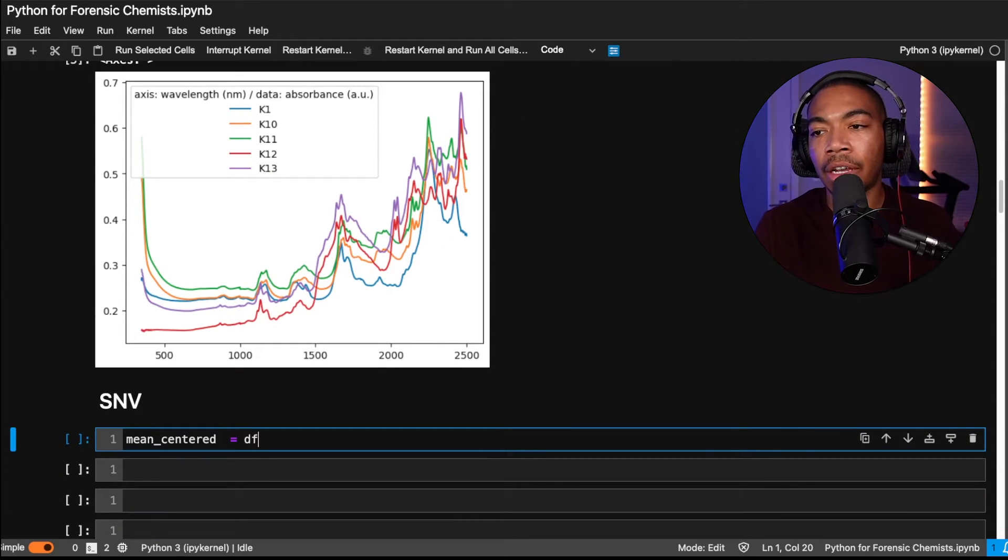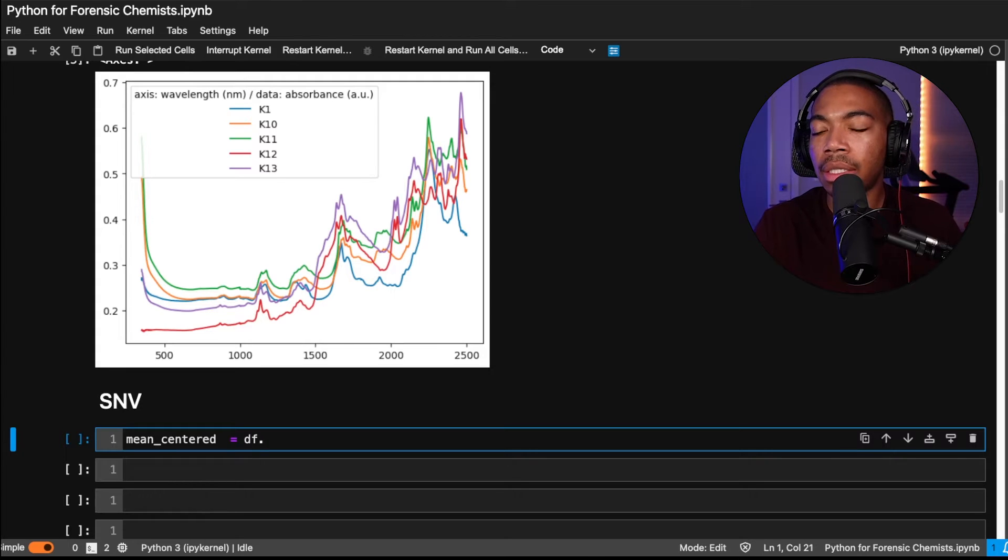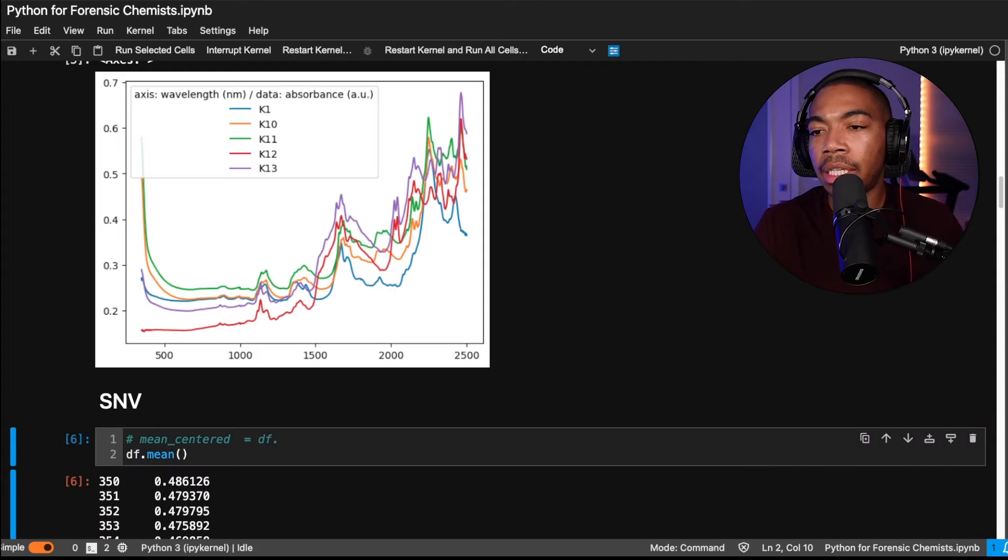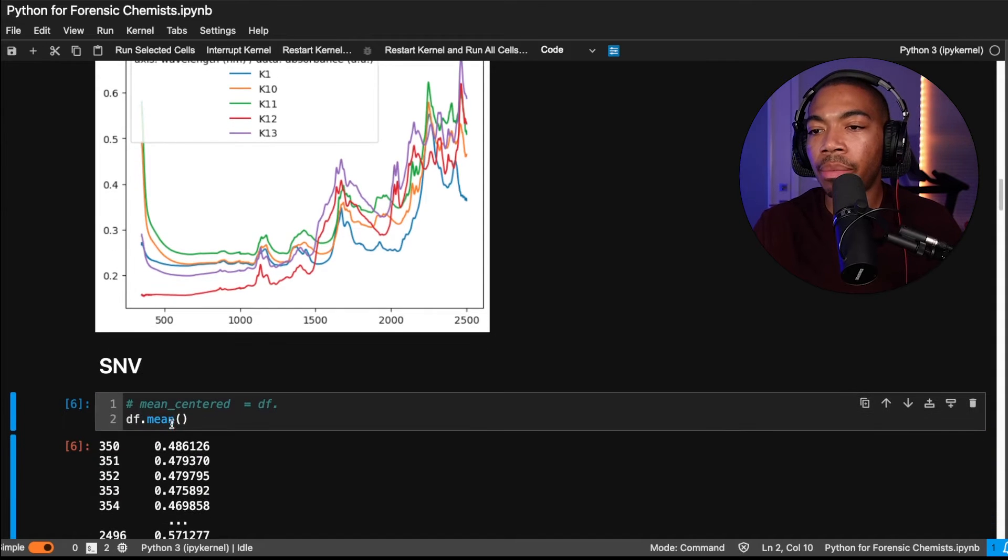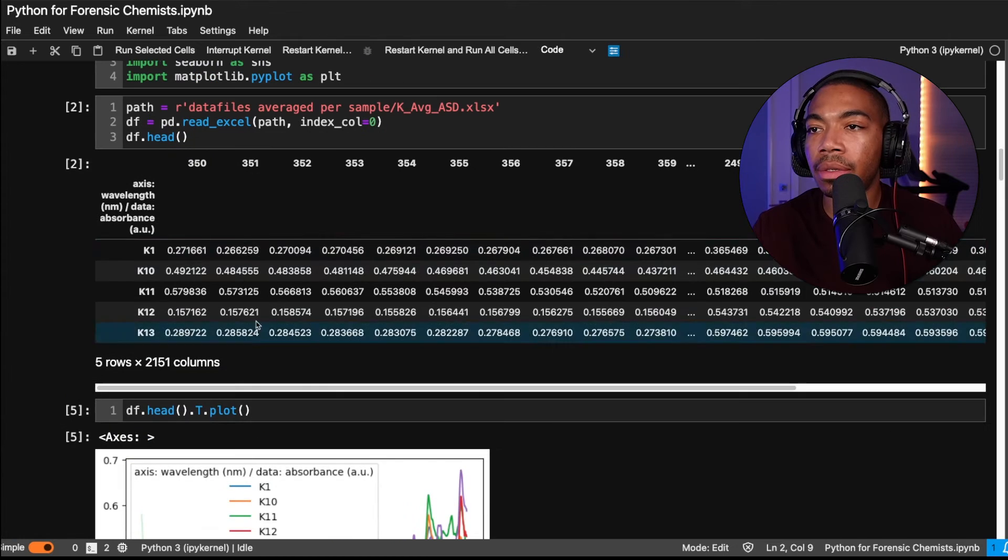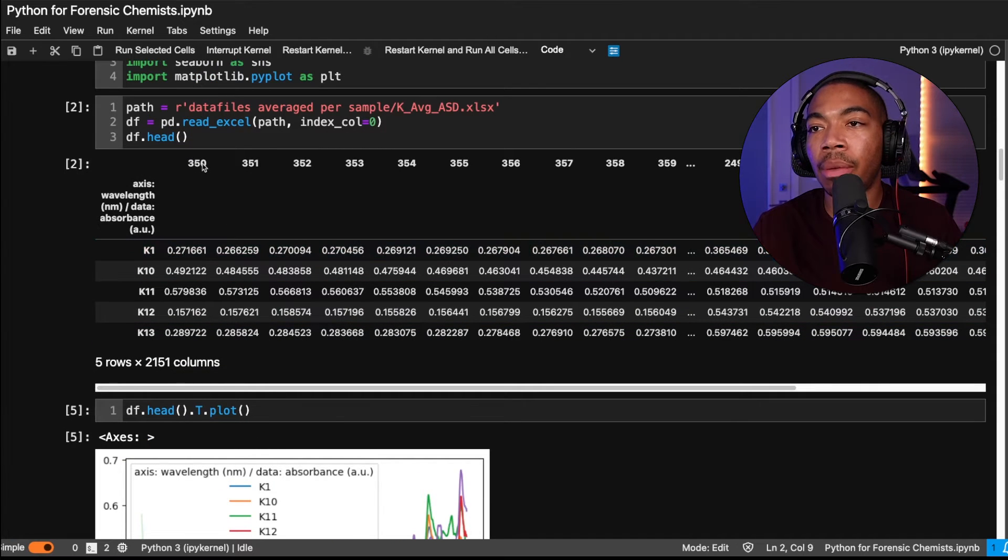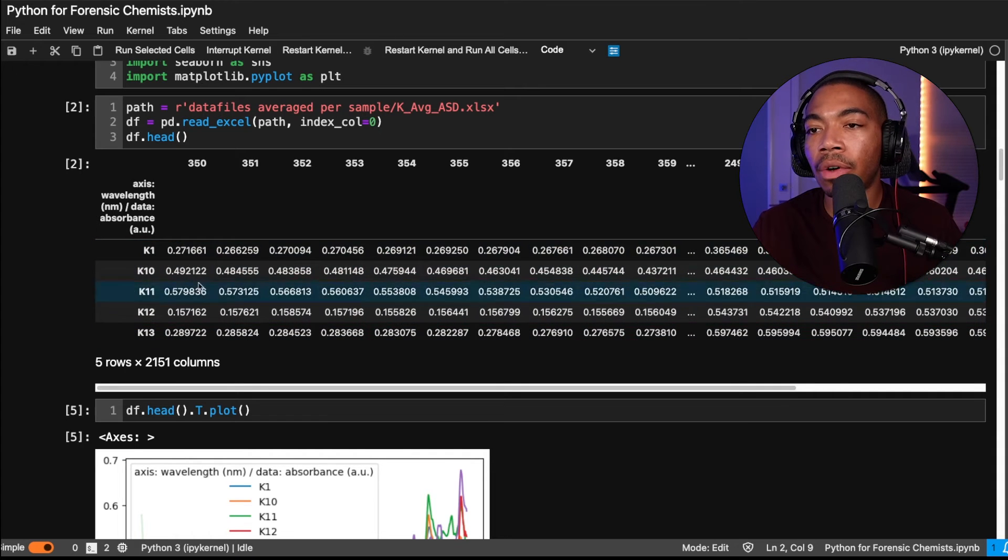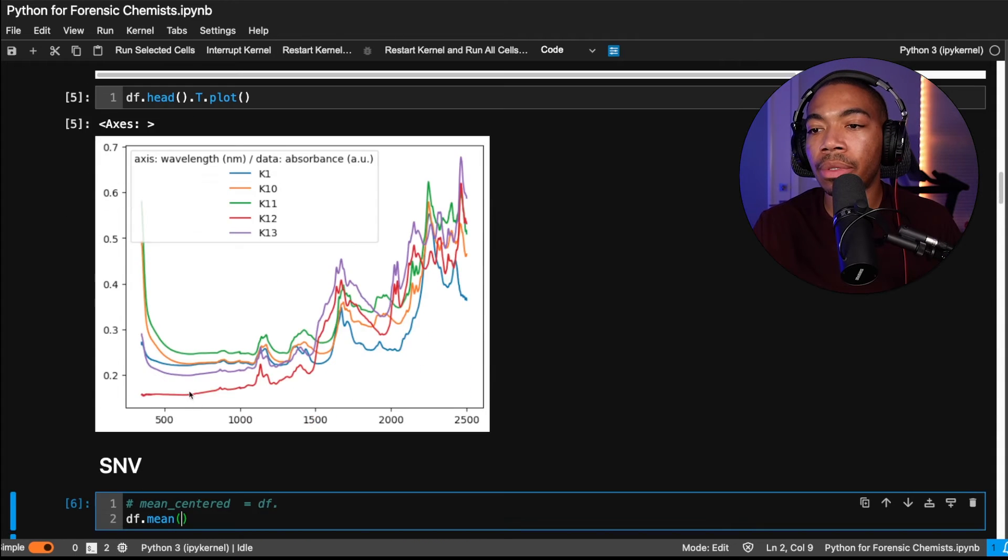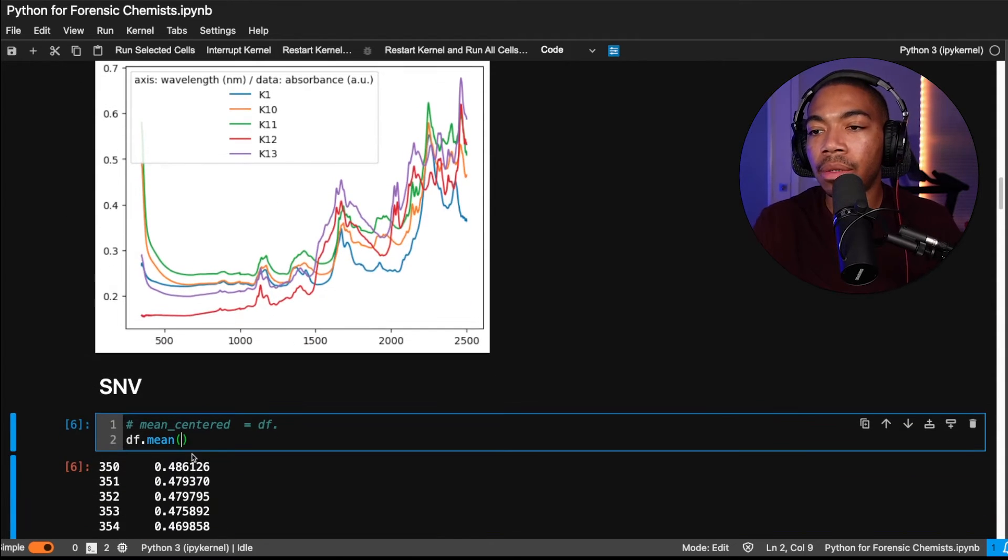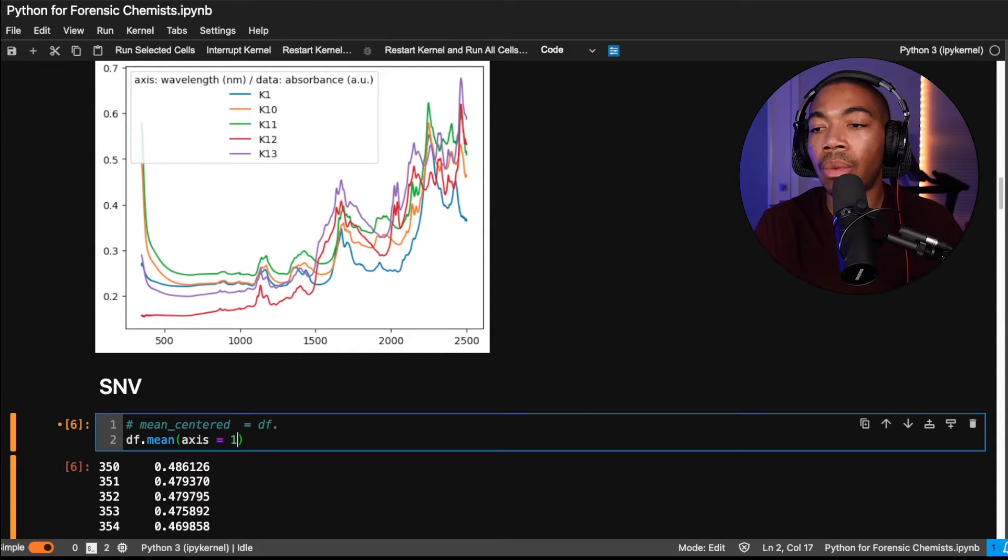So to do that, we're going to use the data frame algebraic methods. And first, let's compute, let's not save that variable yet. So first, let's compute the mean. And by default, the mean will compute across each of the wavelengths. And this is not what we want. So this is going to compute a mean for 350, 351, 352. But that would be, of course, for all of the samples.